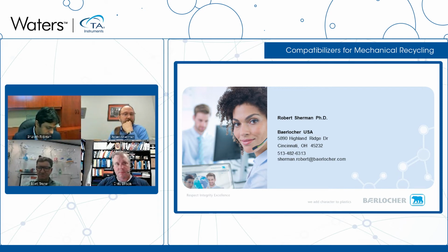One of the first questions that I'd like to start off with is around the OIT results that Dr. Sherman showed in your presentation. The question was around, does OIT really correlate with heat aging in an oven? Is it necessarily quicker, and can it really be reliable at the same time? So maybe you could comment on that.